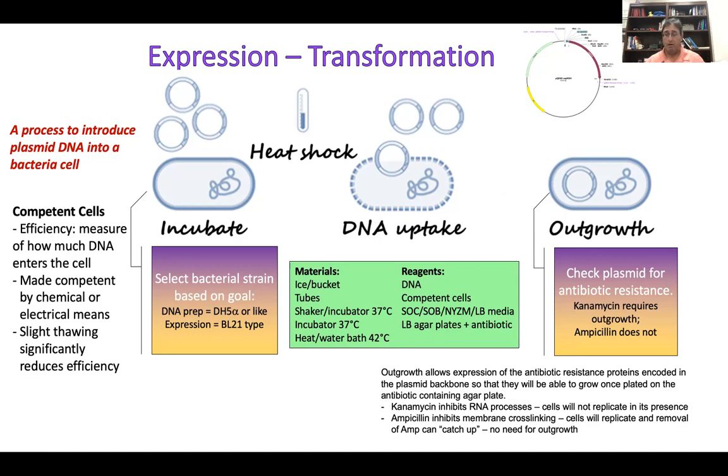That way, any bacteria that doesn't have the plasmid won't be able to grow, divide, and create daughter cells in the presence of that antibiotic. Only those cells that have your plasmid are going to be making a protein that degrades that antibiotic, thus they can grow. So antibiotic resistance isn't magical. It means that there's an enzyme being produced from some gene that the bacteria got. That enzyme will grab onto one of these antibiotics and degrade the antibiotic.